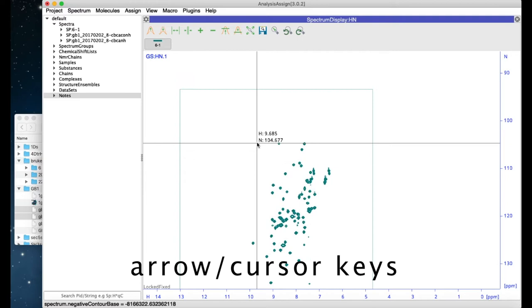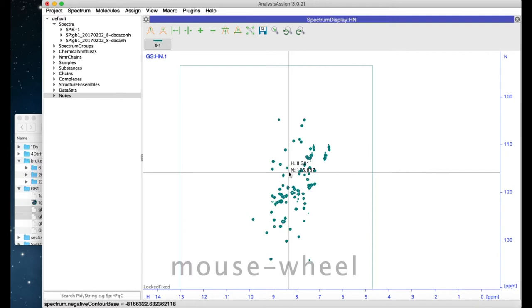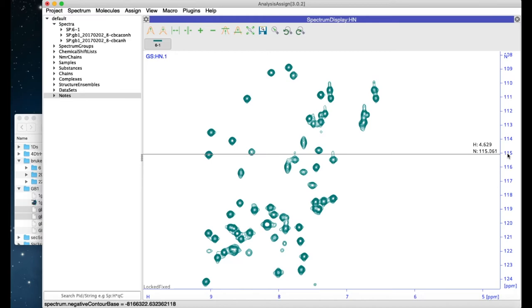You can zoom in using the mouse scroll wheel. If you use this on one of the axes, then it selectively zooms in on that axis.